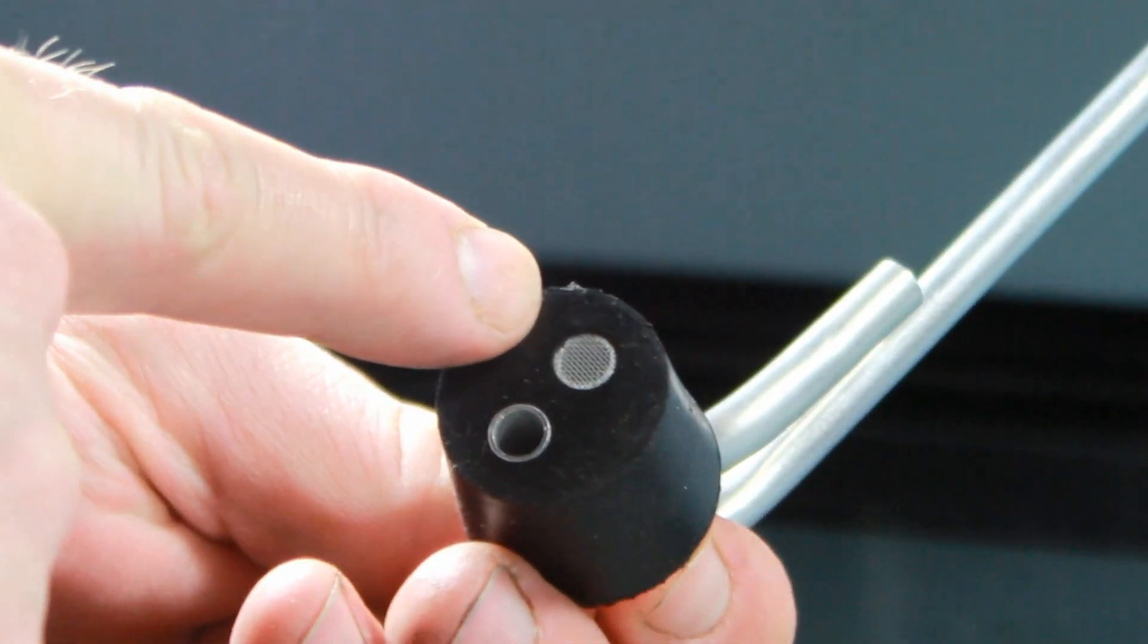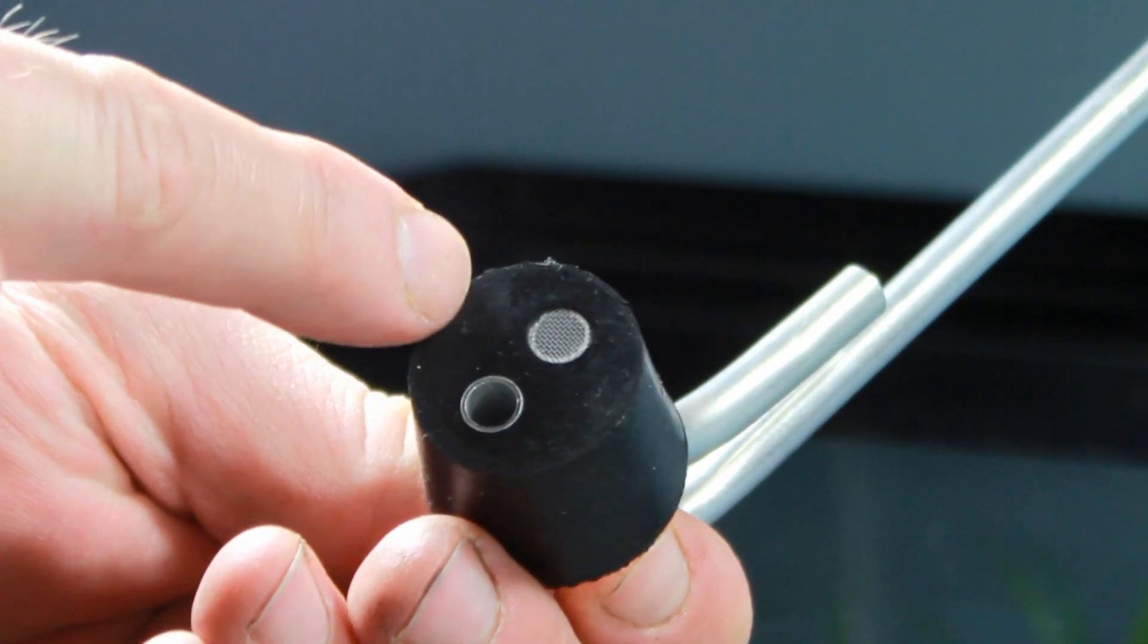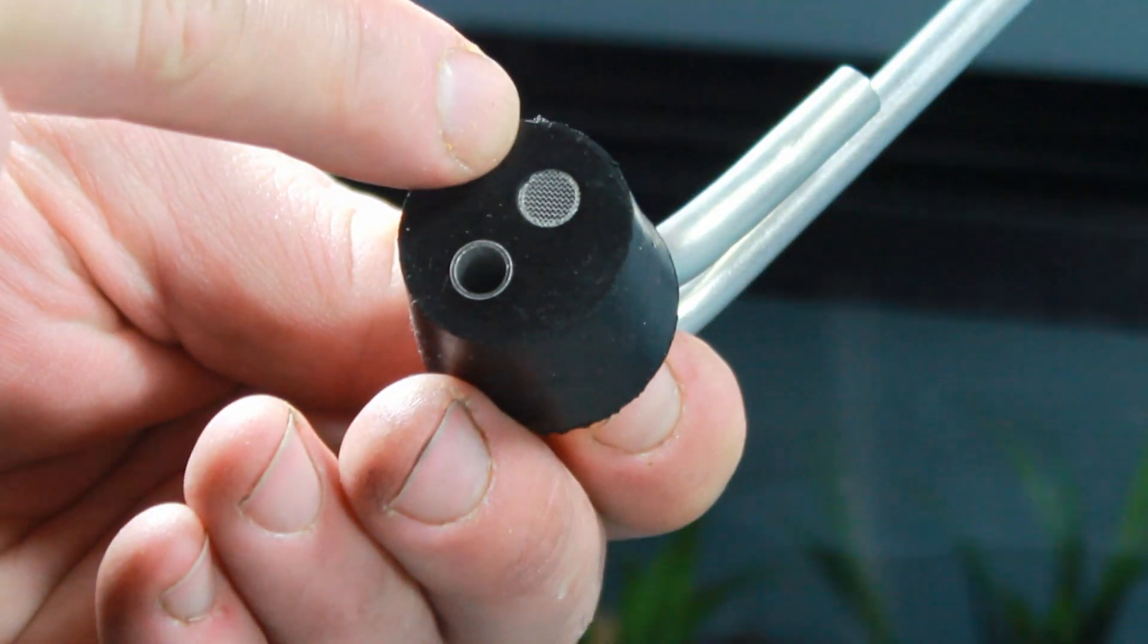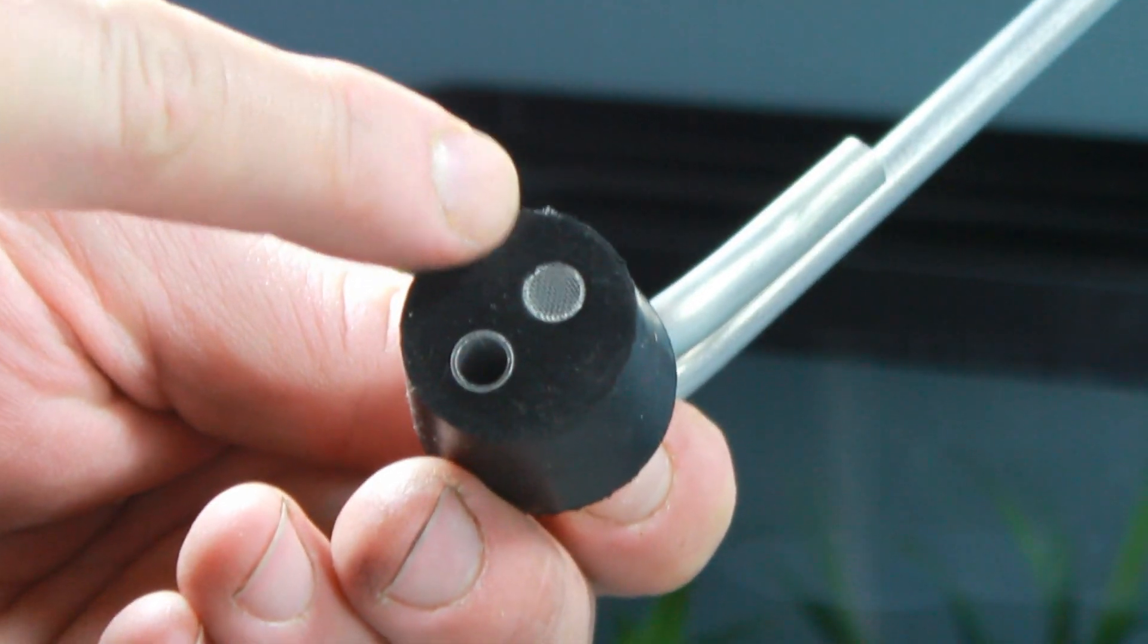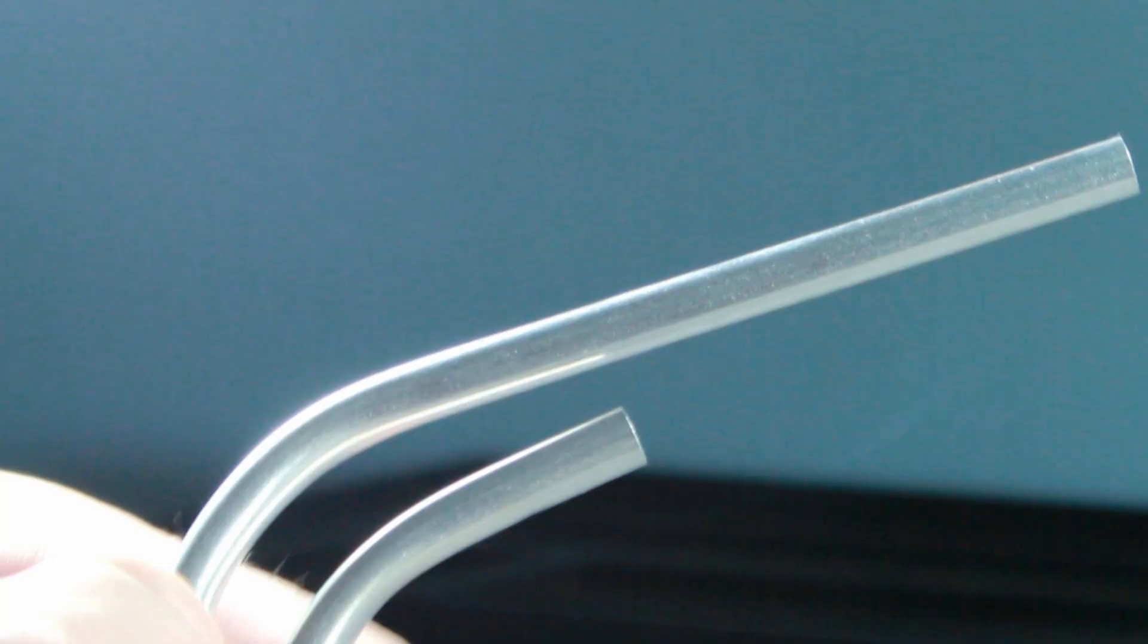This is the lid on the aspirator itself. One hole with the screen, one hole is open. The hole with the screen goes to the piece that you're going to be inhaling or sucking into. This pulls the ants into the vial.